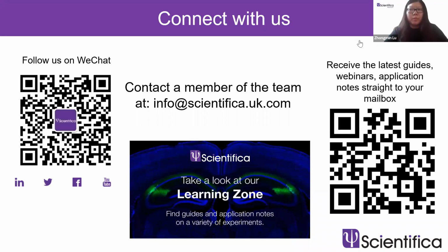So usually it will be around 2 Hertz or 5 Hertz. Typically in this range. And that's also related to the field of the imaging you're going to do, right? I was mentioning 512 times 512 pixels.